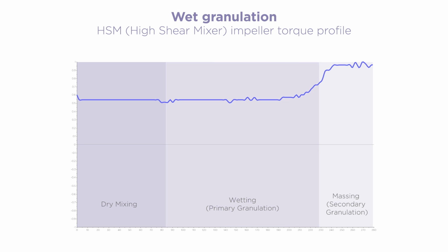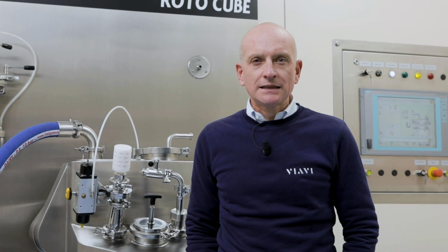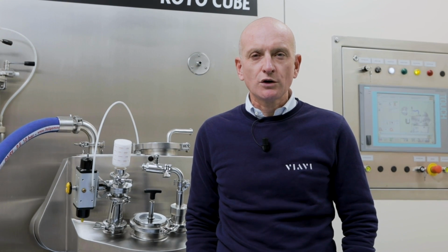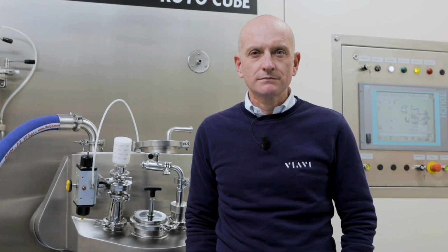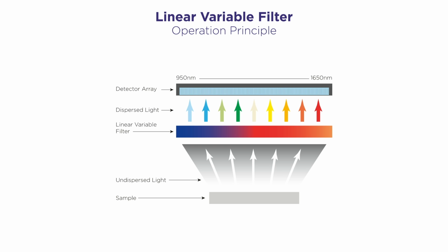Back in 2012, VIAVI Solutions introduced the first MicroNIR, called 1700. This device is still the smallest NIR on the market and allows us to have a smart sensor applied to process control, also in ATEX environment. MicroNIR sensors are equipped with a near linear variable filter, operating without any moving part and therefore completely maintenance free.